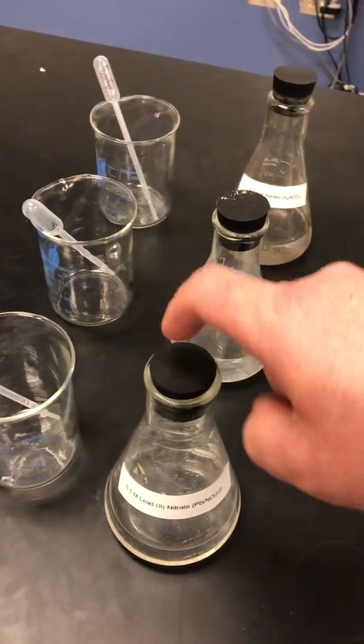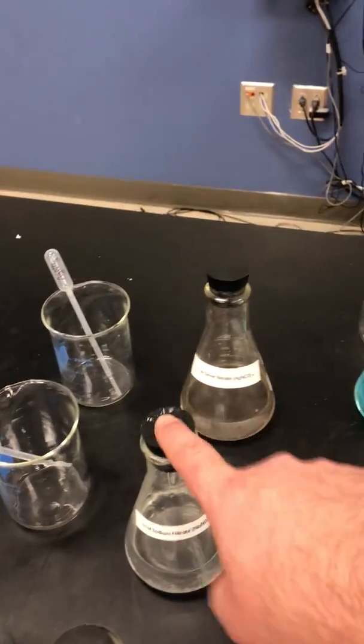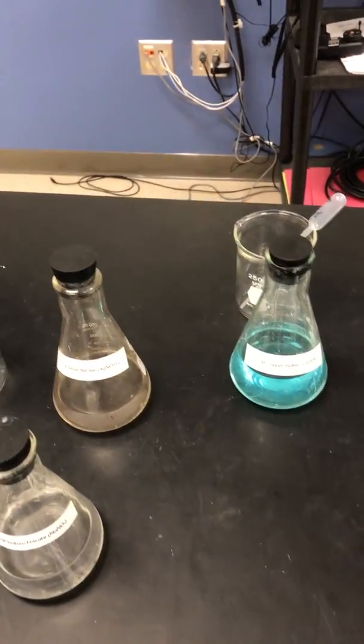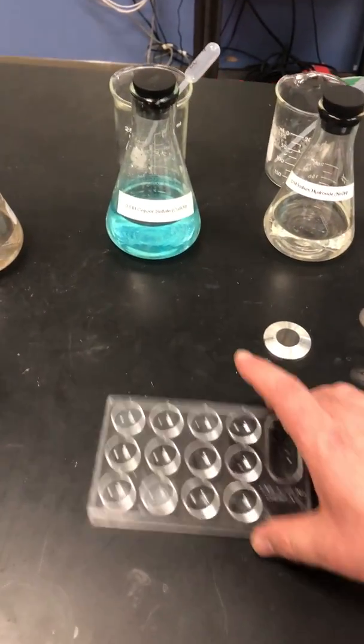You're going to take 5 drops of this one and run through the well plate. 5 drops here, 5 drops here, 5 drops here. Then this one, 5 drops here, here, and here. You getting a feel for this yet? And this one, 5 drops in each. And I lined them up like this for a reason.